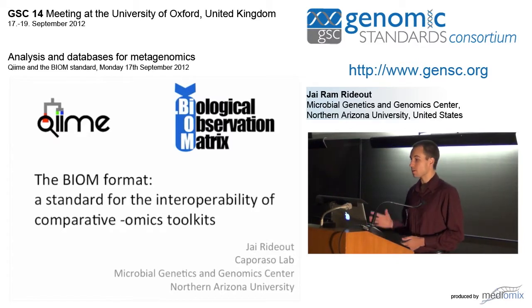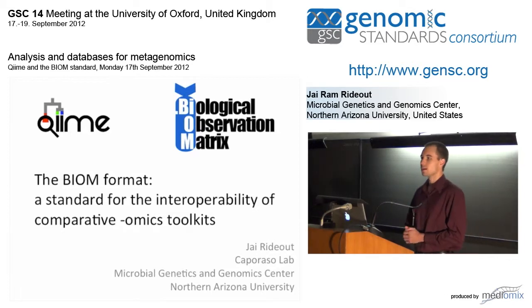But yeah, I'm going to be talking about the BIOM format mainly today, and a little bit about QIIME, just to start things off and give some context to where the BIOM format might fit into comparative omics toolkits, using QIIME as an example.